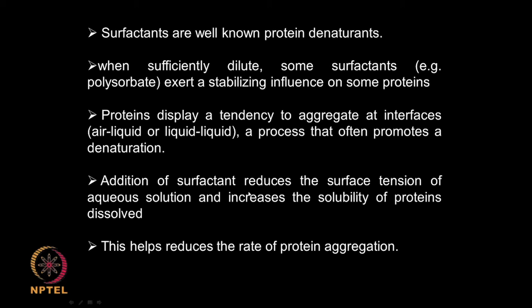But if I add surfactant, it reduces the surface tension of the solution and increases the solubility of the protein. So, the protein will not come to the air liquid or liquid liquid interface, thereby the protein remains in solution.